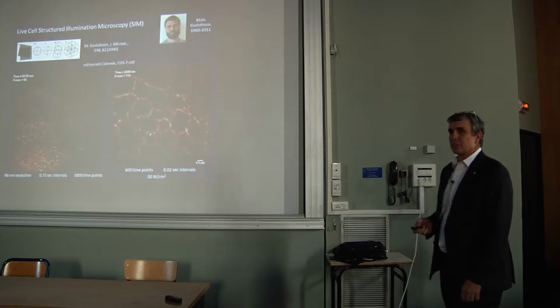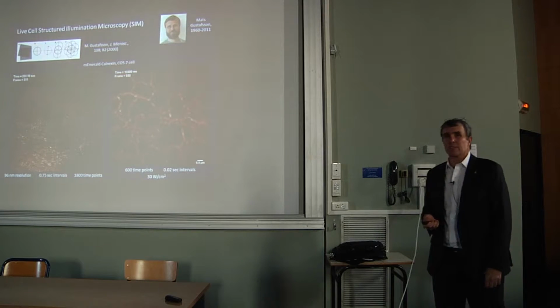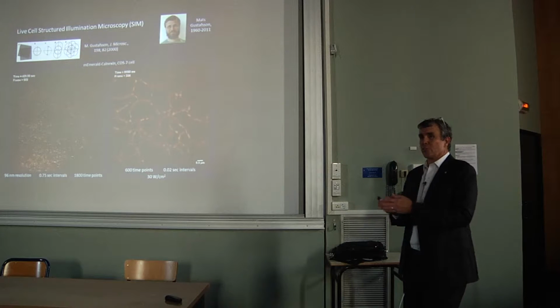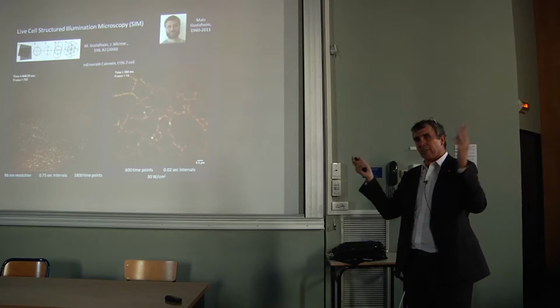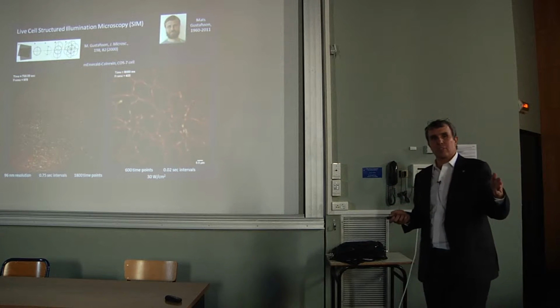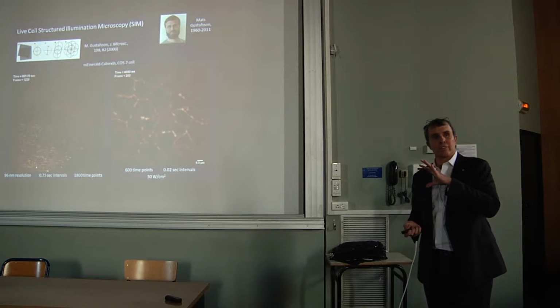So the one guy who appreciated those trade-offs before the rest of us was Mats Gustafsson, who was one of the pioneers of a different super resolution method called structured illumination microscopy. In this technique, it's a wide field method, not single molecule, in which instead of illuminating your sample uniformly, you illuminate it with a grating pattern, usually a standing wave that's created right at the edges of the diffraction limit. And then that standing wave beats against the different features inside of the sample to create low-frequency moire fringes, which are within the resolution limit of the microscope and hence detectable.